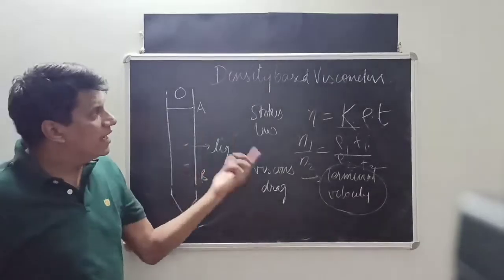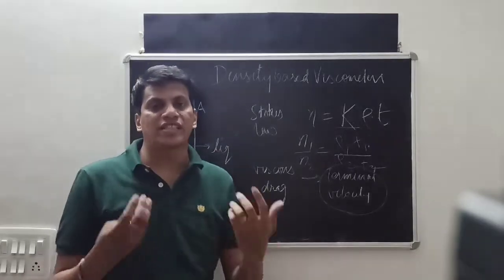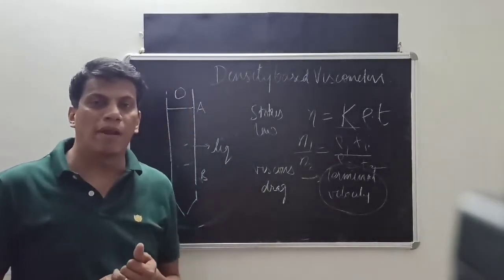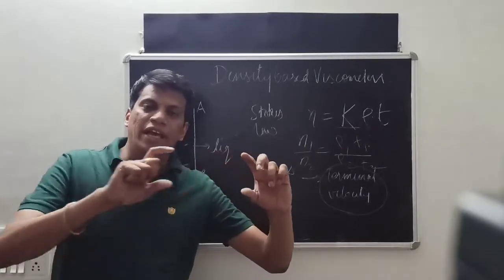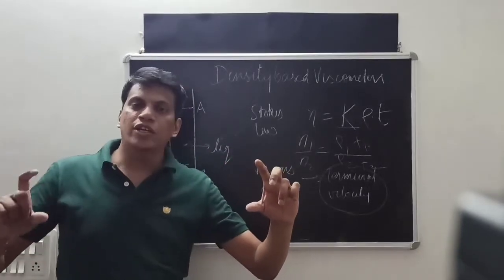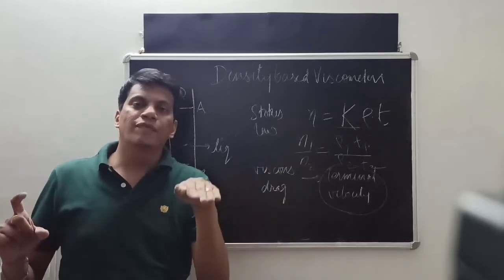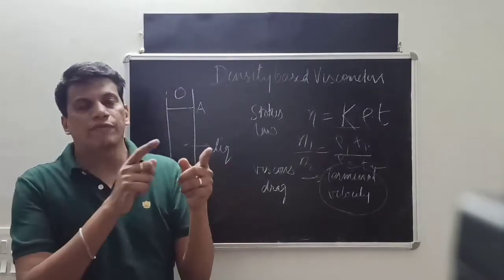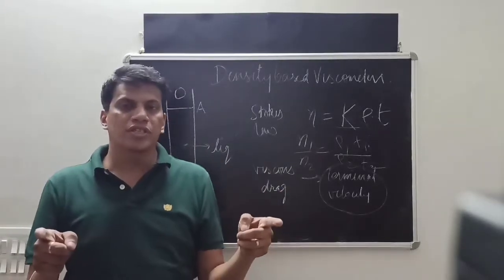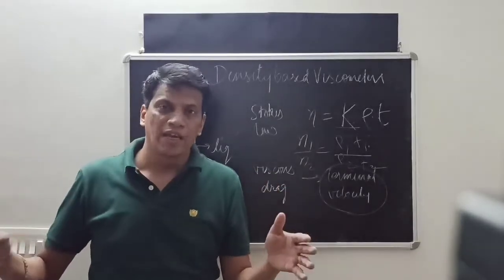Now, this is the falling sphere. The second one is the rising sphere, the example of which is the bubble viscometer. To understand it, we can take 10 tubes. One tube is our test tube, and the remaining 9 are standard, filled with liquids of different viscosities, say from 1 to 9. So hypothetically 1, 2, 3, 4, 5, 6, 7, 8, 9.